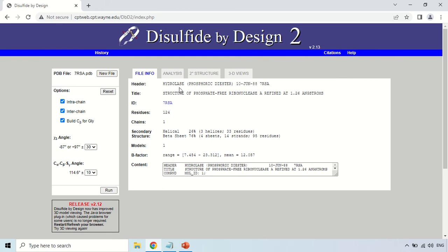Now you can see the results. Before the results, there is basic information about your selected sequence. That protein is a hydrolase, uploaded to PDB on 10th June 1988. The title is 'Structure of Phosphate Free Ribonuclease Refined at 1.26 Angstrom'. The protein contains 124 amino acid residues and has only one chain.